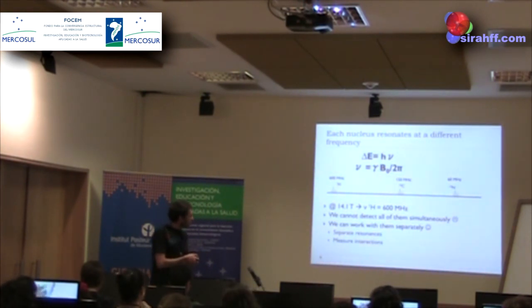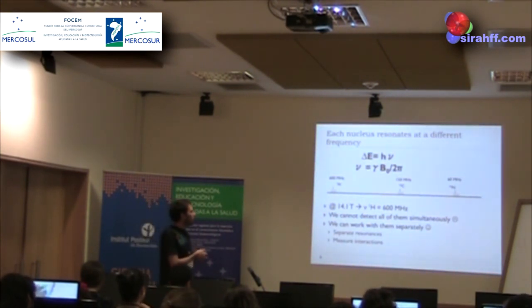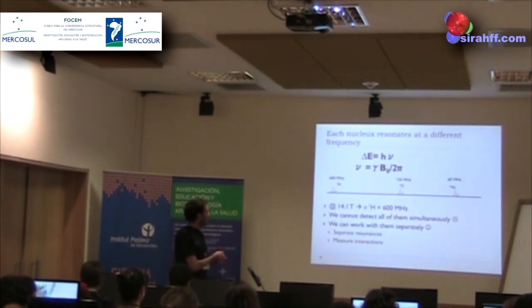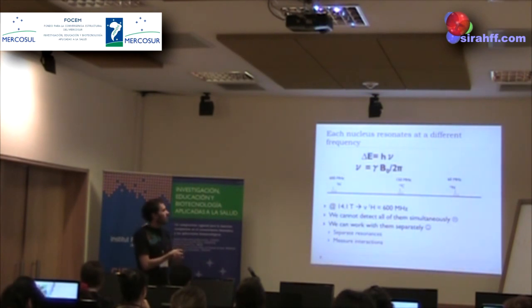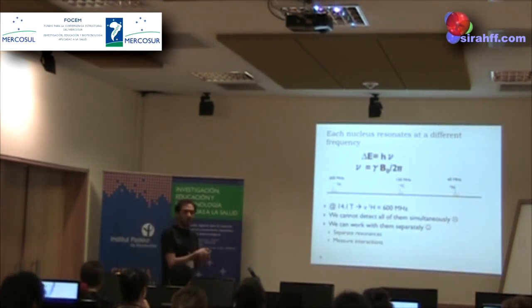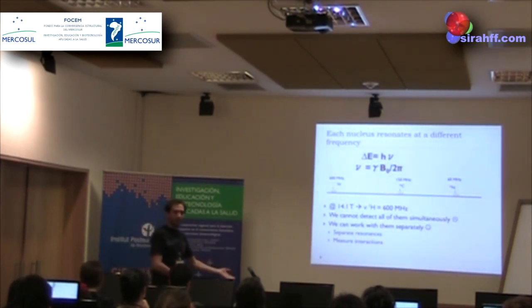And I don't want to forget this important thing. In NMR, we don't measure the strength of our magnets in the natural magnetic units, Gauss or Tesla. We define the magnet strength by the frequency at which protons resonate. So you will hear that this lab has a 400 megahertz spectrometer, 600 megahertz, 300 megahertz, whatever.